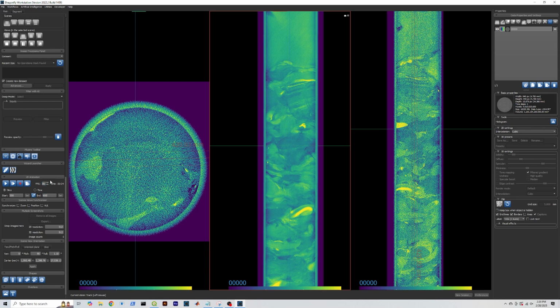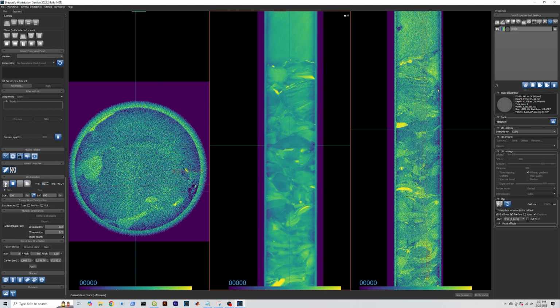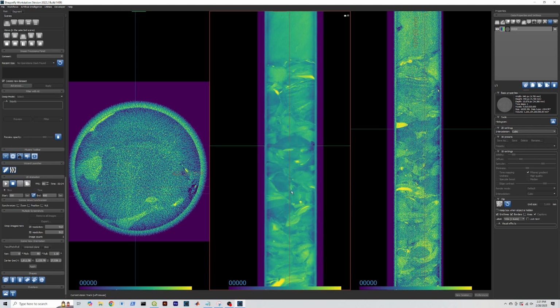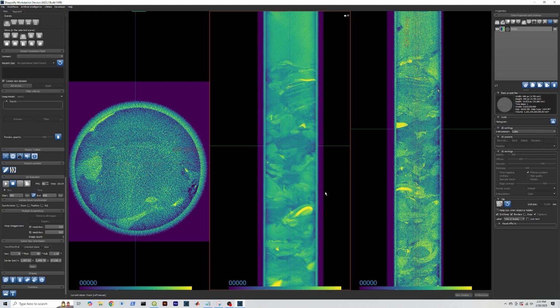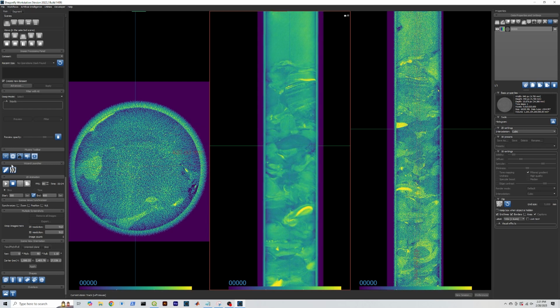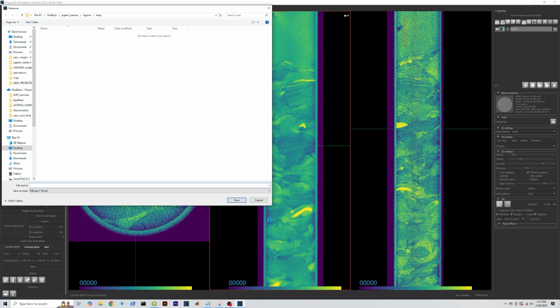And 80 frames per second is going to be pretty fast, but we'll just show you what that looks like. Alright, so here it is passing through the image automatically. And if you wanted to export that video or the series of pass-throughs, what you would do is you click stop and then you go to export and you can export to wherever you'd like.